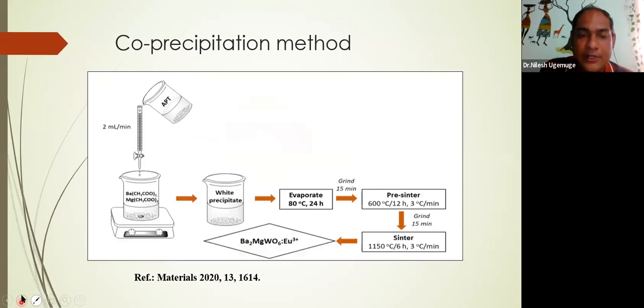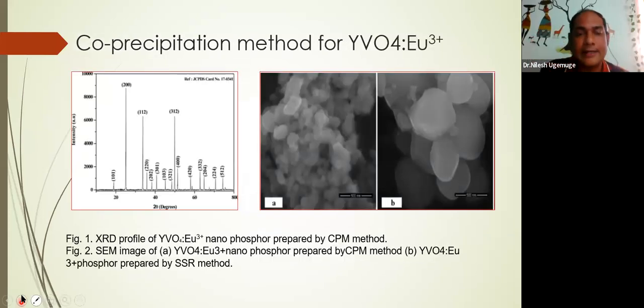Another method is the co-precipitation method, which is the most preferred wet chemistry method, in which we add some solutions with some acid, and then stir with heat, using a magnetic stirrer with hot plate. The precipitate we can filter out, and wash this precipitate a number of times. The components which are not required are washed out, and the remaining product is used for the XRD, X-ray diffraction.